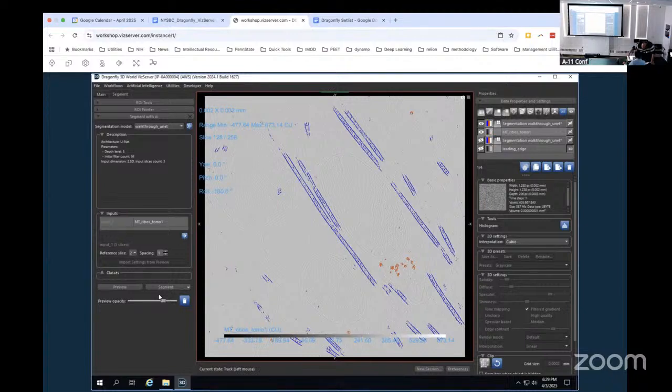All right, so right click on that and go to calibrate intensities. Drag that one all the way. Keep going. Try that. The foreground should be at the mode, and then the background should be at this one standard deviation total. We can calculate that, but we're just doing it by eye. But I bet it'll work. It'll show you right here that it's calibrated. Pretty good. You can close that. Rerun.